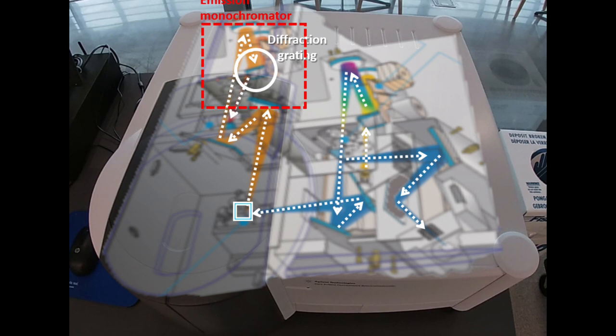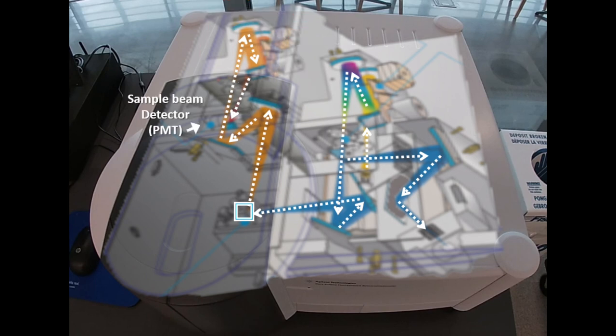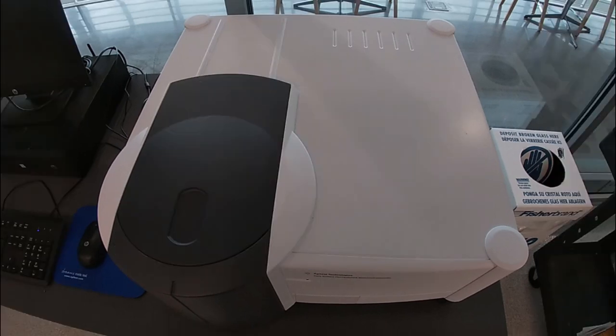That optimal selected wavelength then moves to our photomultiplier tube, which is the detection system for our device. And that concludes our tour of the Agilent Cary Eclipse.